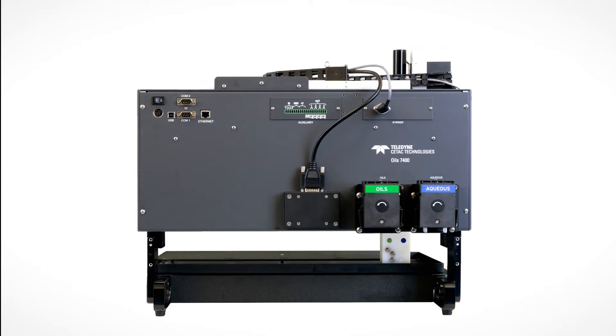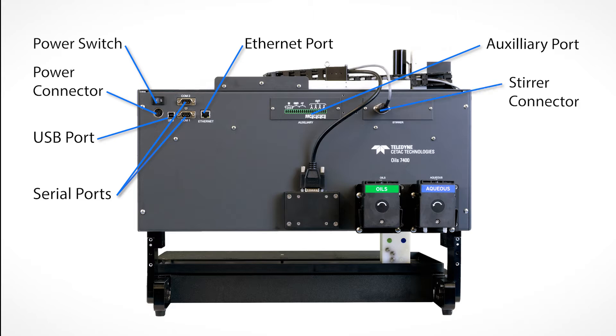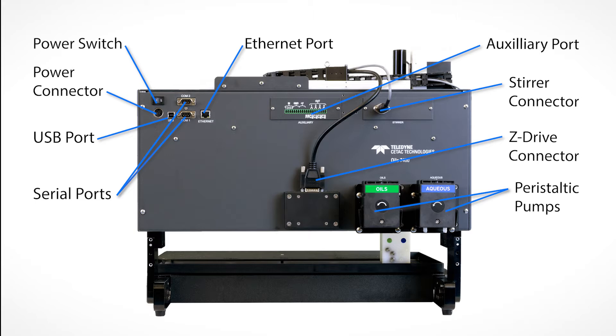On the back of the Auto Sampler are the power switch, the power connector, a USB port, two serial ports, an ethernet port, an auxiliary port, the stirrer connector, the Z-Drive connector, peristaltic pumps for oils and aqueous rinse solutions, and rinse station fittings for oil and aqueous.